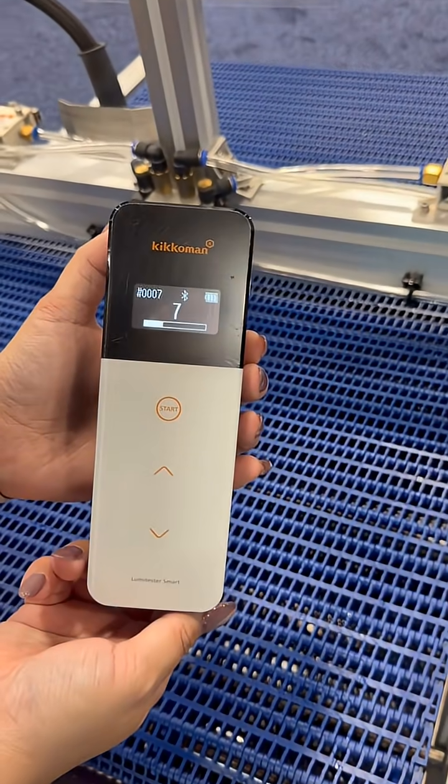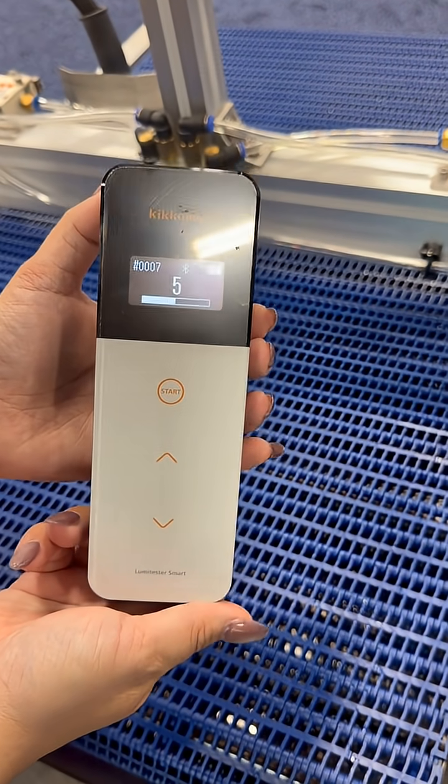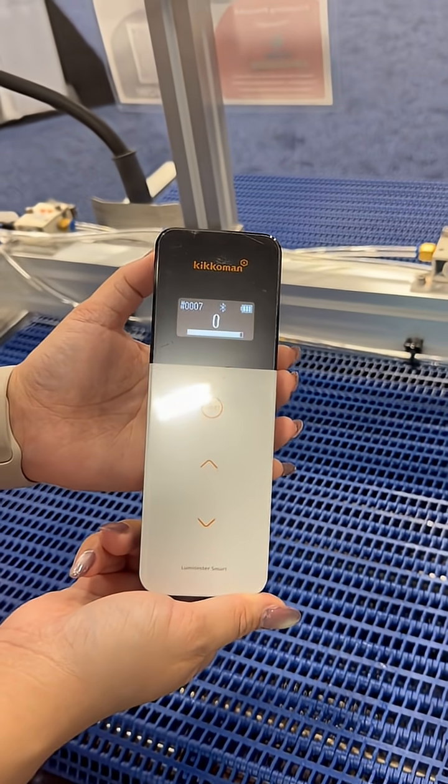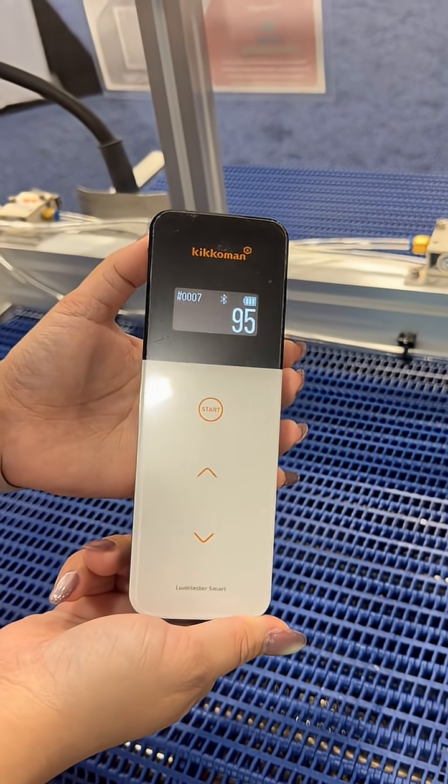And what's this unit called? It's called the Lumetester Smart, and it's going to show in Relative Light Units. All the way down to 95.